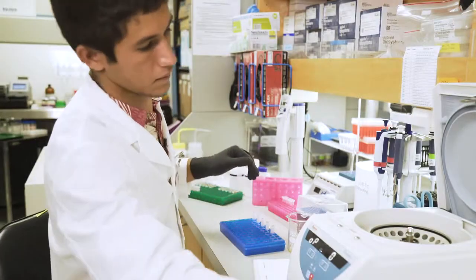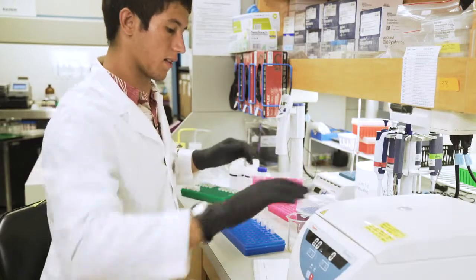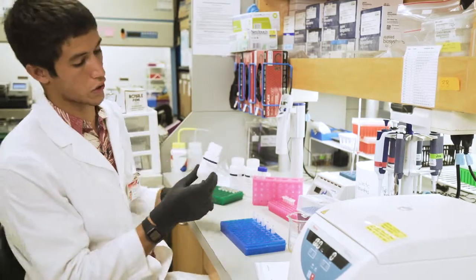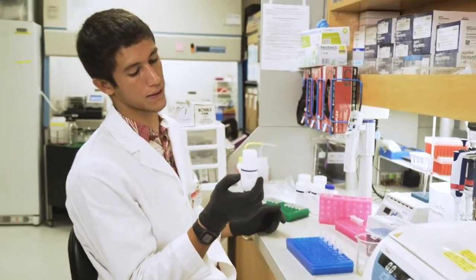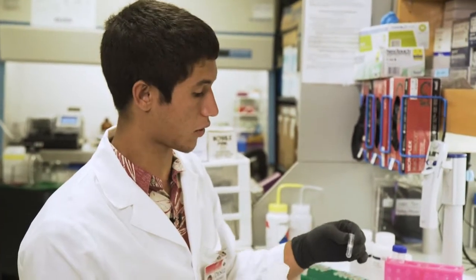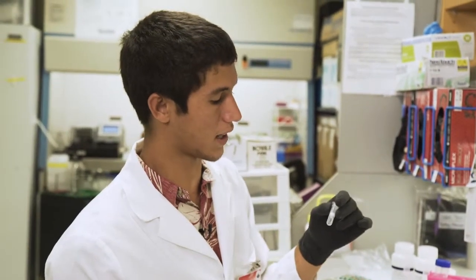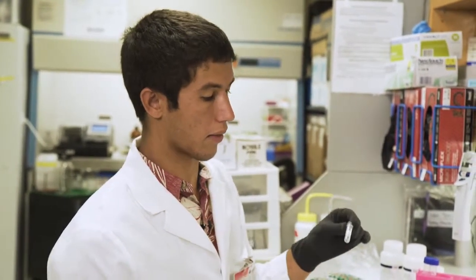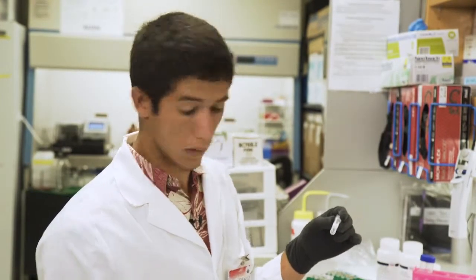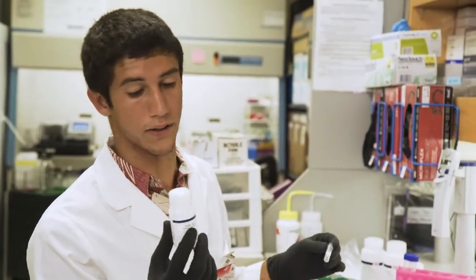All right. So last step, last little bit of liquid to add is the elution buffer. How much elution buffer you add decides how much final volume product you'll have. Because we're dealing with just a small amount of DNA for the most part, and the tissue samples we used were pretty small, we're going to use only about 50 to 100 microliters of elution buffer.